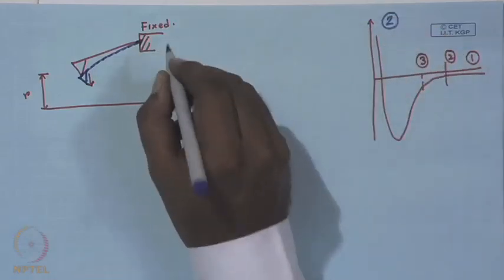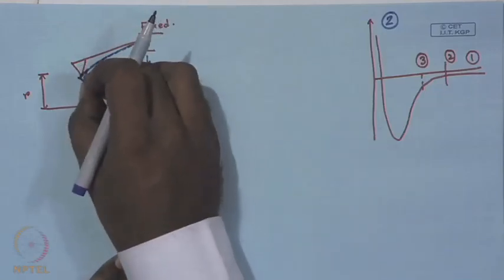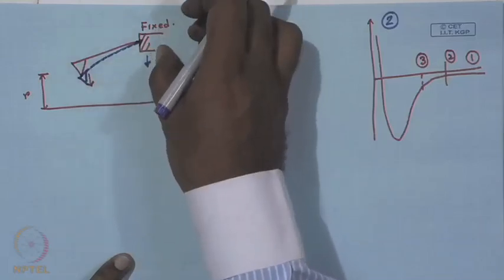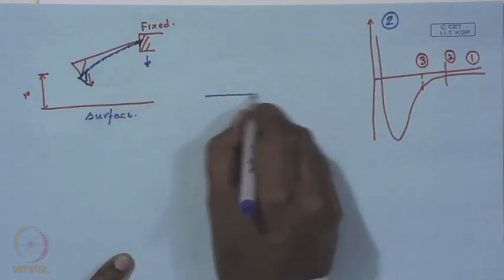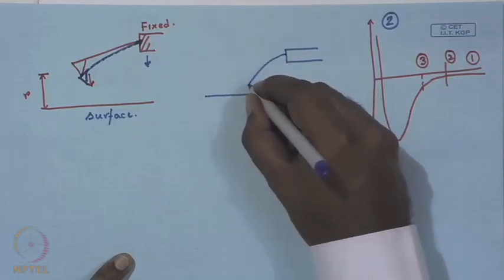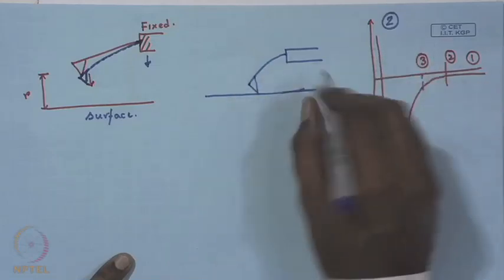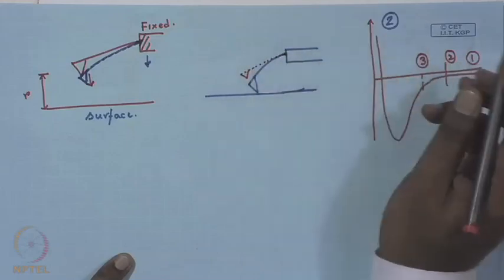Simultaneously, your vertical motion due to the stepper motor is still progressing. So, on one side this bends because of the attraction, and on the other side you are still bringing in the cantilever in closer proximity to the surface. So, consequently what happens, after a while the cantilever touches the sample surface. So, this was the original deflection free configuration of the cantilever.